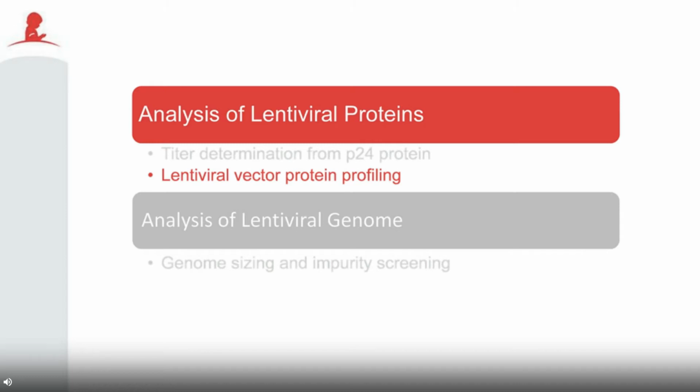So next, we're going to look at lenti-vector protein profiling. That is, what does the proteome look like in an electropherogram for the lentivirus vector?